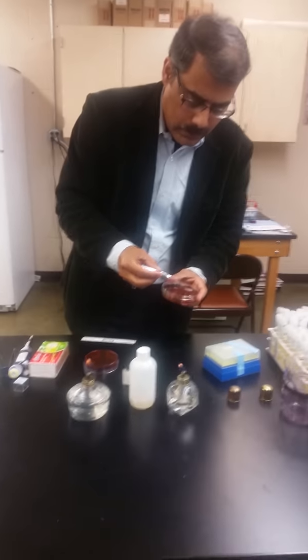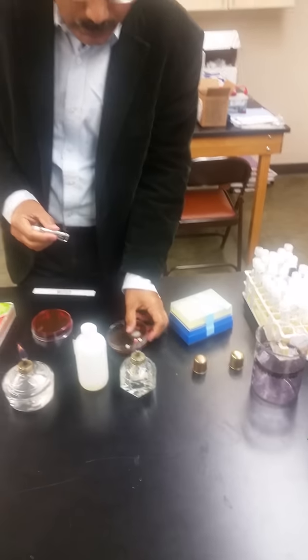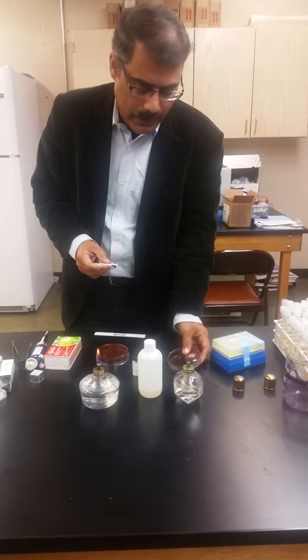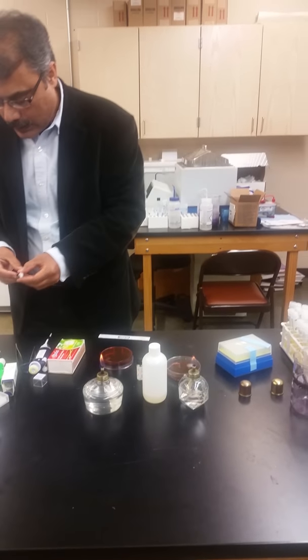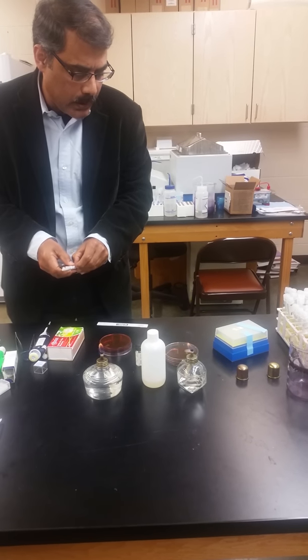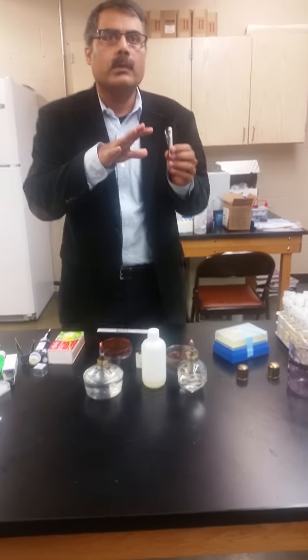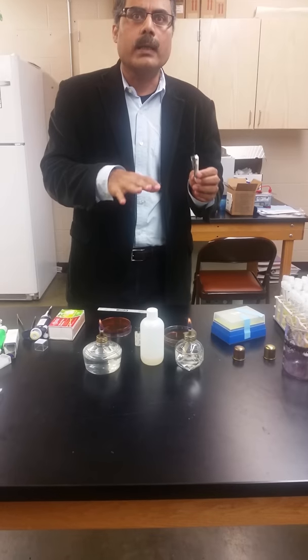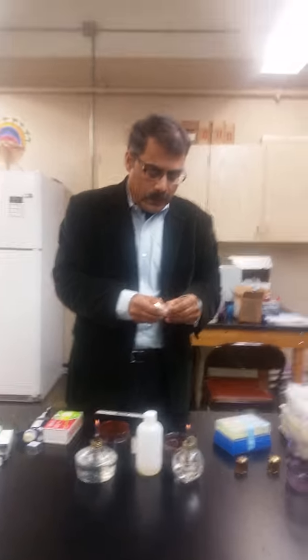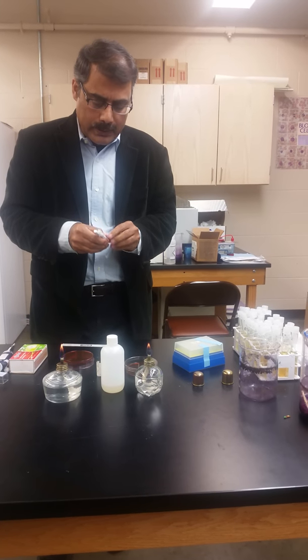And basically this goes here, and you will incubate them right there like this, okay, not invert them, because they will drop off. So what will happen is basically these discs will lose their drug, because it will get diffused into the medium, and wherever it is diffusing, the bacteria, if they are sensitive to it, will not grow on it. That's as simple as that.